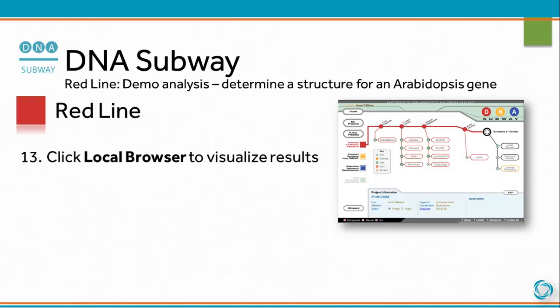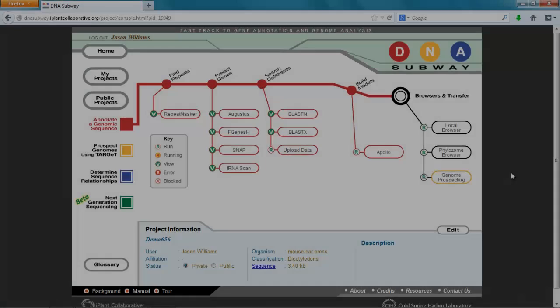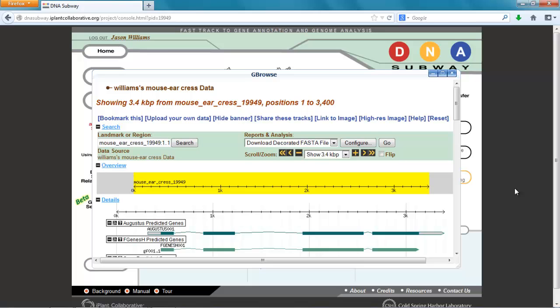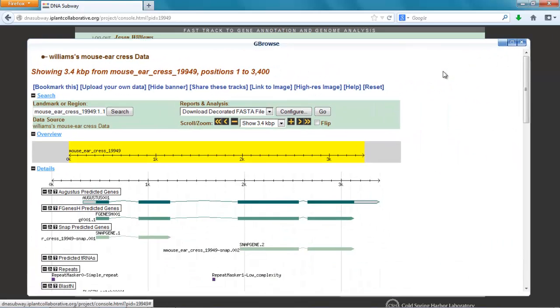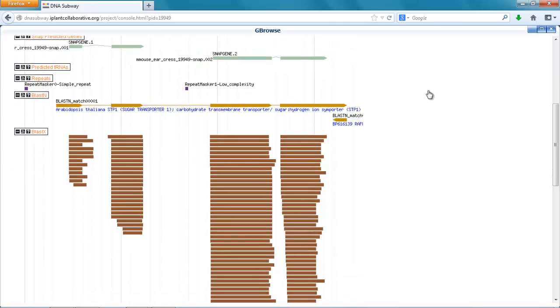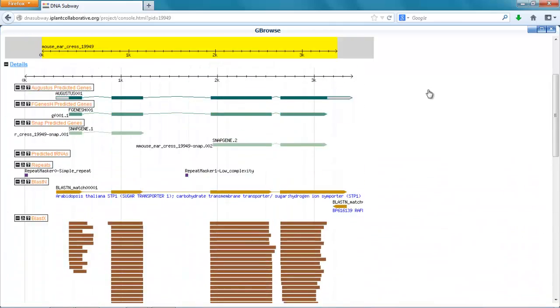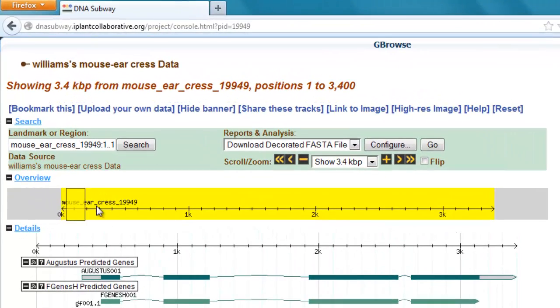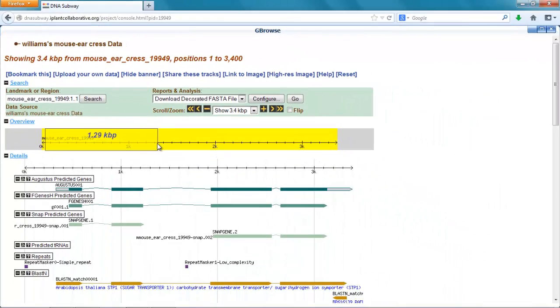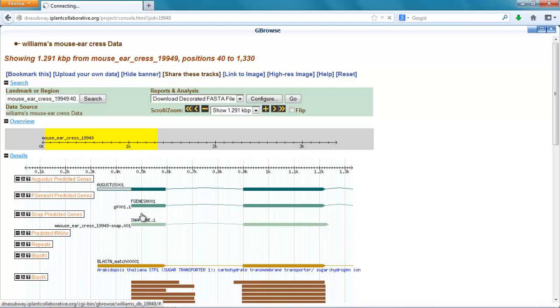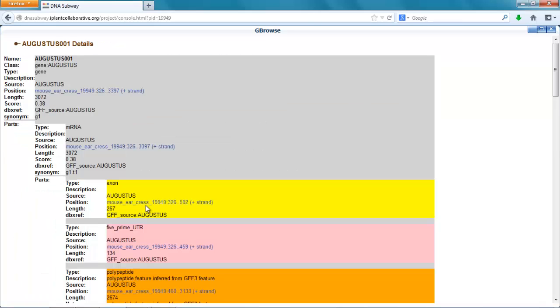Click Local Browser to visualize results. Click BLASTX to search and import more data.